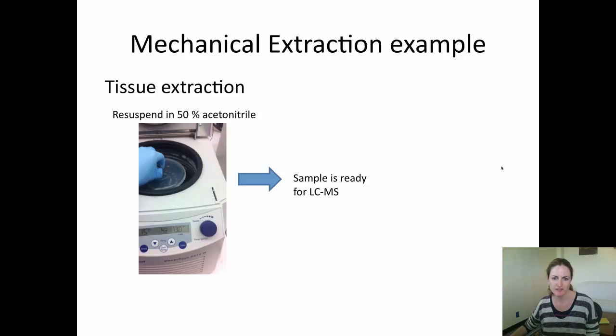We re-suspend the sample in 50% acetonitrile and transfer to an auto-sampler vial. The sample is now ready for LC-MS.